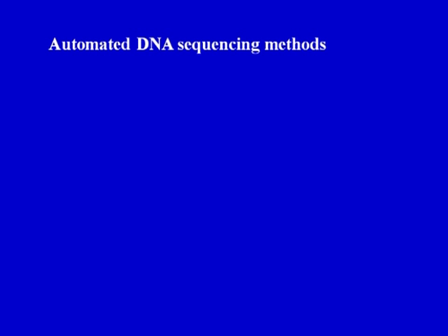Now, DNA sequencing methods have been automated and a lot of manual intervention is lessened. In order to sequence very large tracts of DNA such as an entire chromosome, the Sanger method has been greatly accelerated through automation. This required that the above described radio labeling techniques, which are not readily automated, be replaced by fluorescence labeling techniques. It also has the benefit of eliminating the health hazards and storage problems of using radio labeled nucleotides.